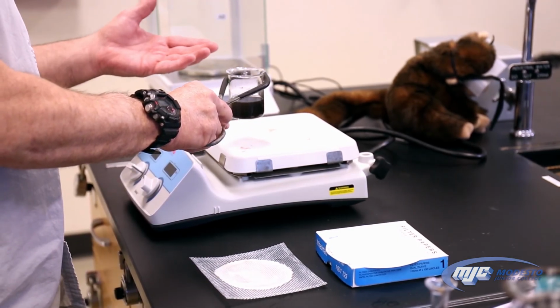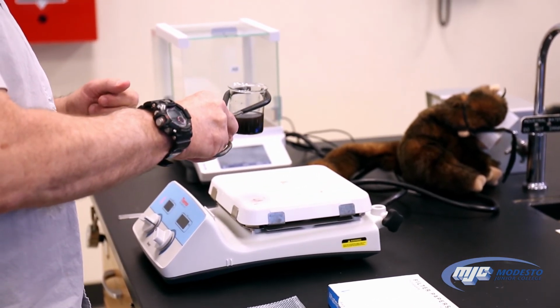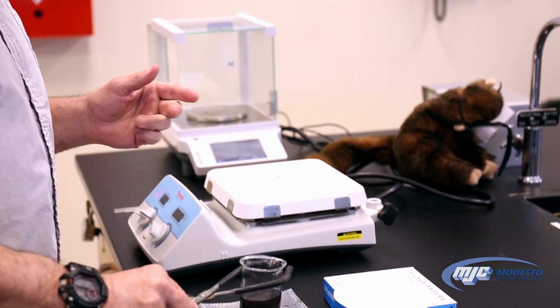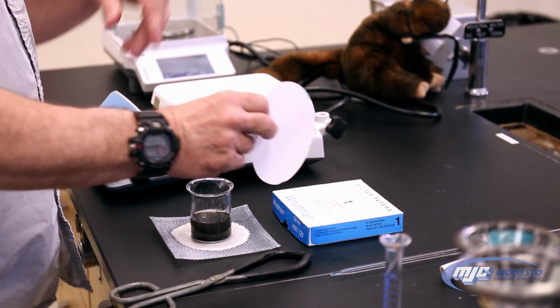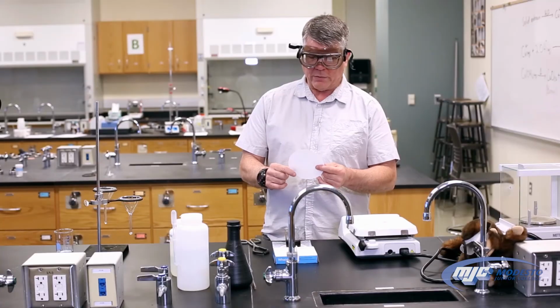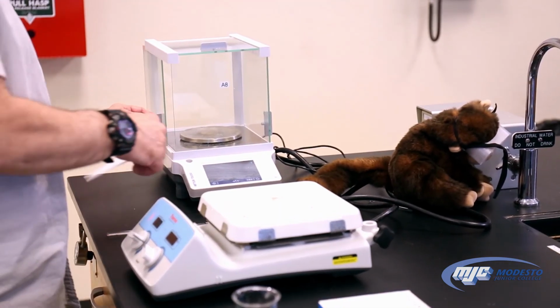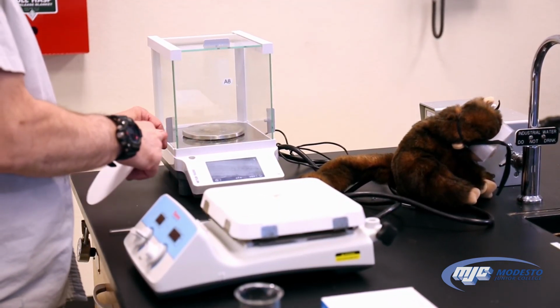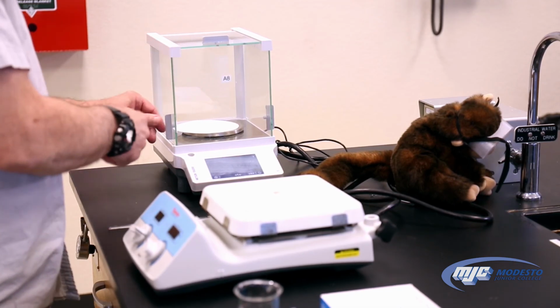All right, guys, now that all of the copper 2 hydroxide has been converted to copper 2 oxide, we can tell because it's all brown, we take it off the hot plate, set it on the wire gauze. While we're waiting for that to cool just a little bit, we don't have to let it get that cool. We're going to take our filter paper that I've already labeled, weigh it, so make sure the balance is 0. Write that number in our data table.